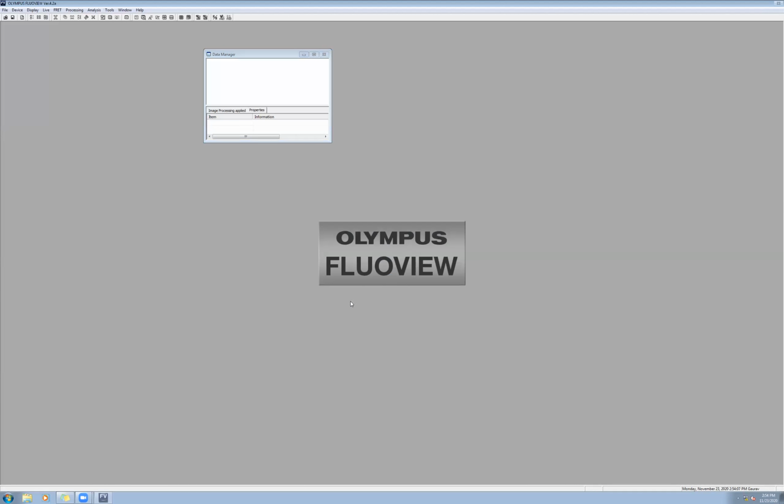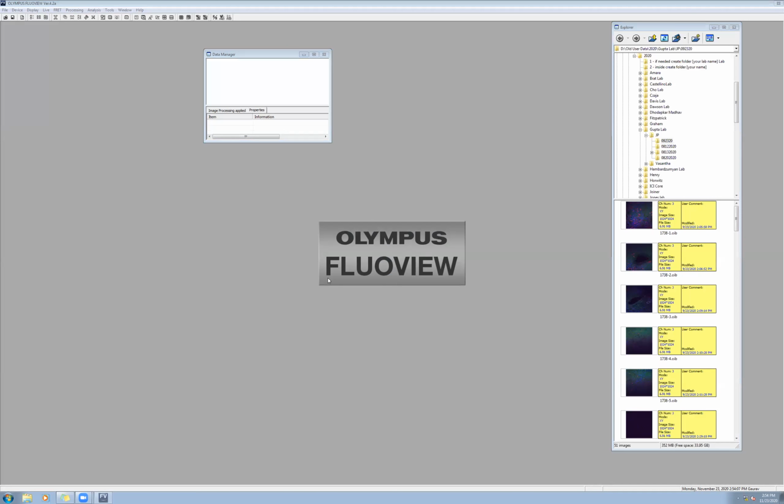The software will start. It will take about 30 or odd seconds for it to completely boot up, and it will make some clickety clackety sounds while it's connecting with the hardware. So while it's doing that, I'm going to go and put one of my slides.